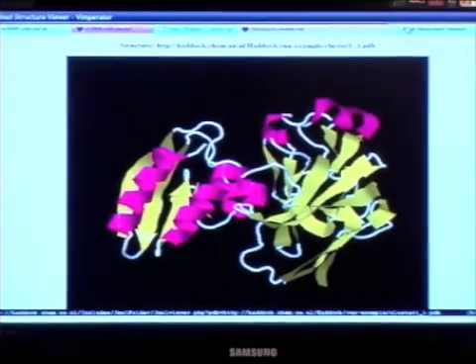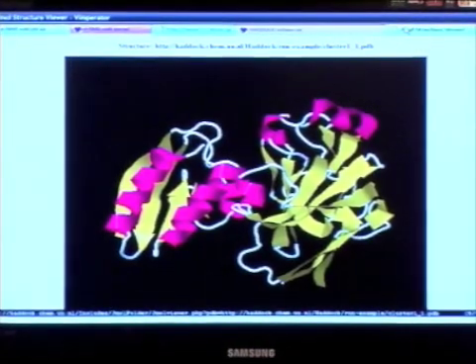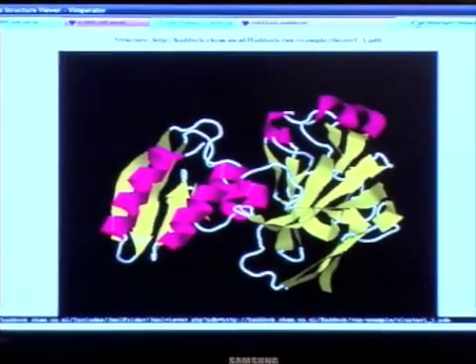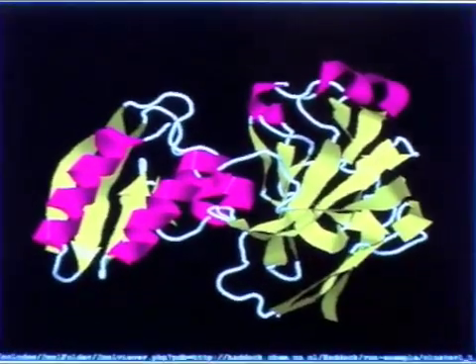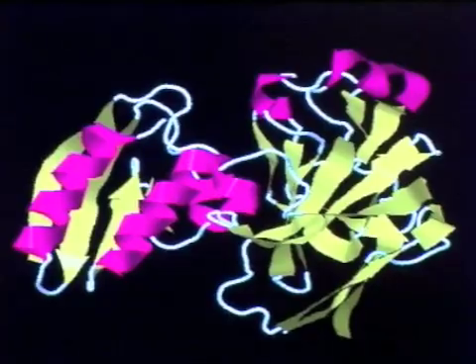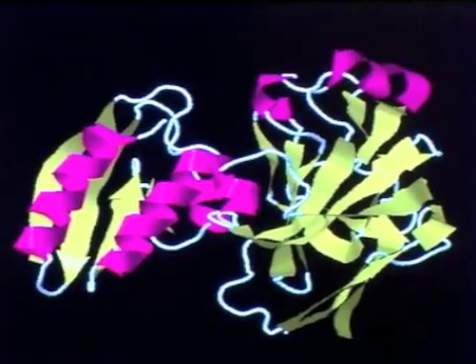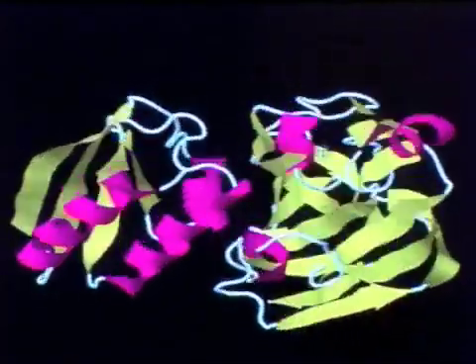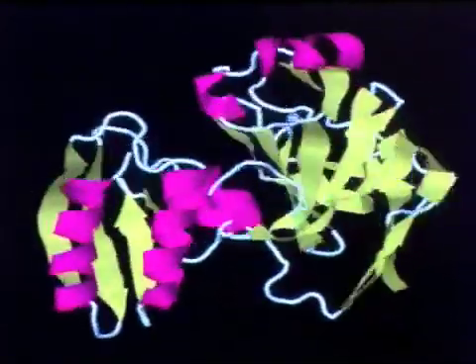That will look like this. Starting from two different components, they can be docked together and you get a complex back which you can even view online using a Java applet.